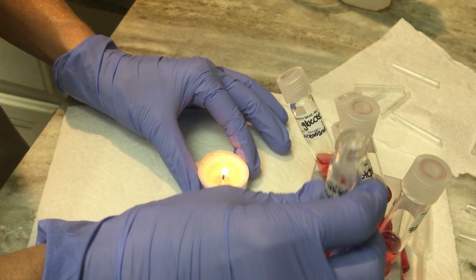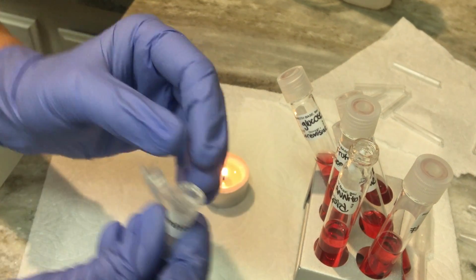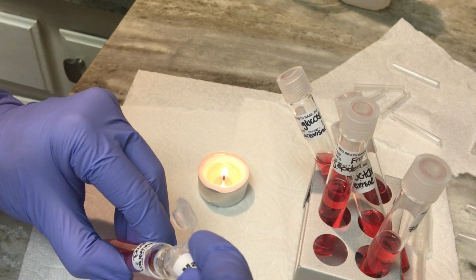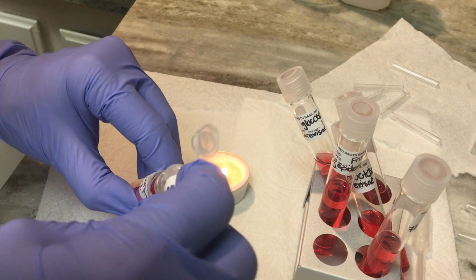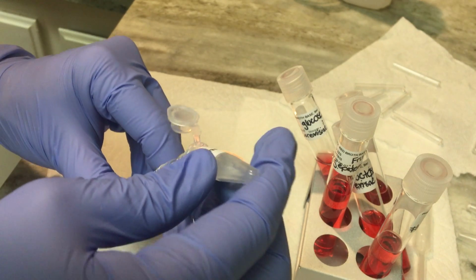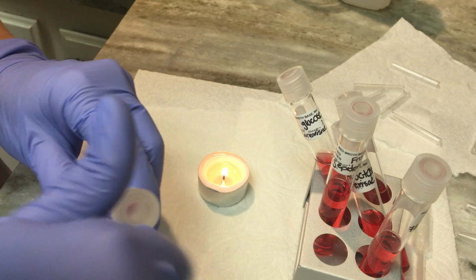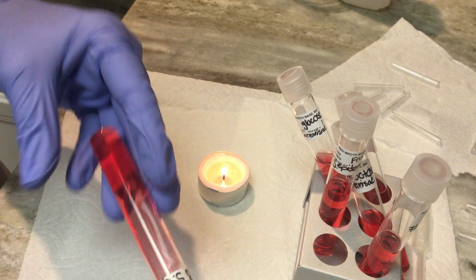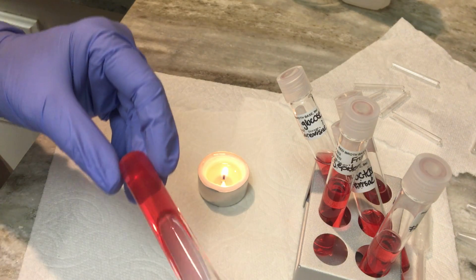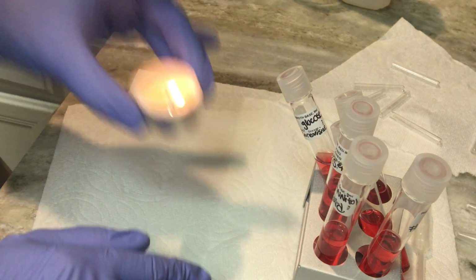As I sneeze, excuse me. And then we have just a little mannitol left, and we're going to carefully place it in this last vial. Kind of had to shake them up. I noticed, probably because they're carbs, that they stick to the bottom. There we go. So we're going to place that in here. I'm going to just do a slight mixing. It didn't say to do this, but it didn't say not to do this. So just so the pieces are not in whole.